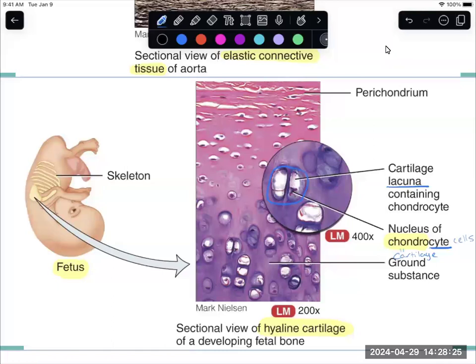In hyaline cartilage specifically, these chondrocytes, the most superficial ones, usually do not pick up color. So these chondrocytes, these cells, are going to remain white on the most superficial layers. Some of the darker ones, you see some darker ones back here, those ones are deeper in from that layer of cartilage that was taken. So the ones that are most superficial on hyaline cartilage specifically.